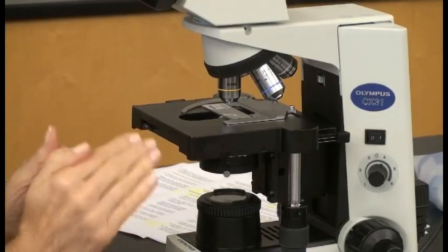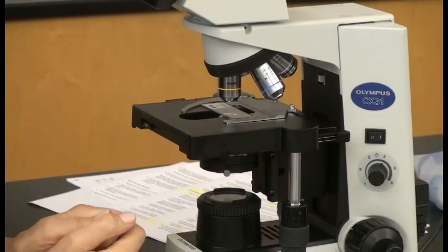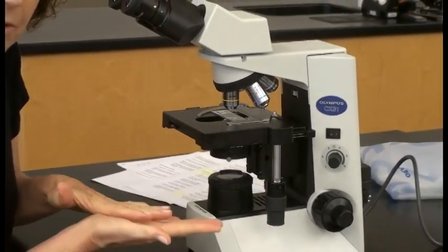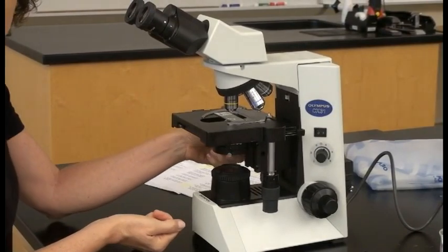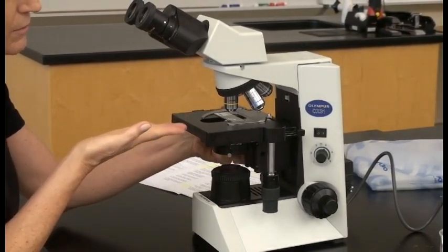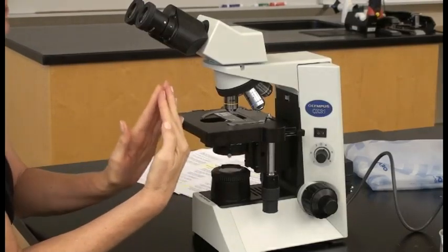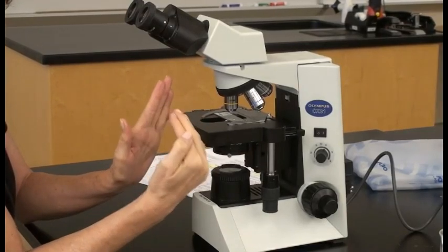Sometimes organisms are clear — such as in parasitology where parasites aren't stained. In that case you may want a little more contrast. You can use the condenser knob and decrease the condenser slightly. What you're doing is lowering the cone of light, which will diffuse your light.